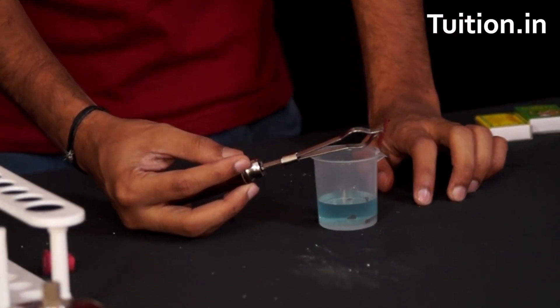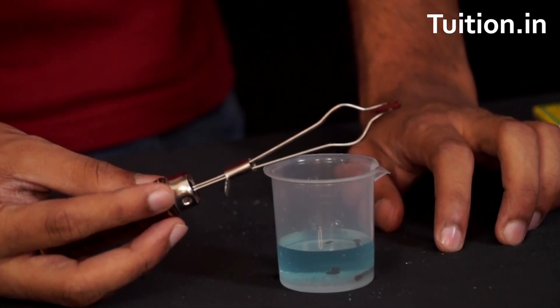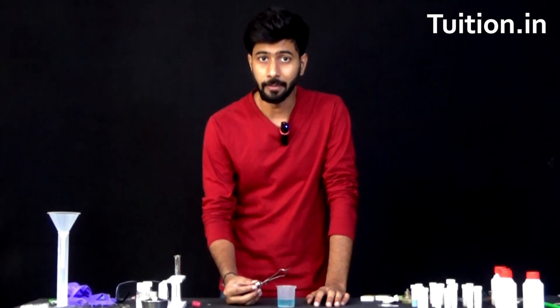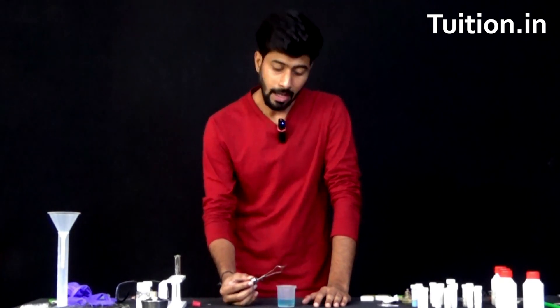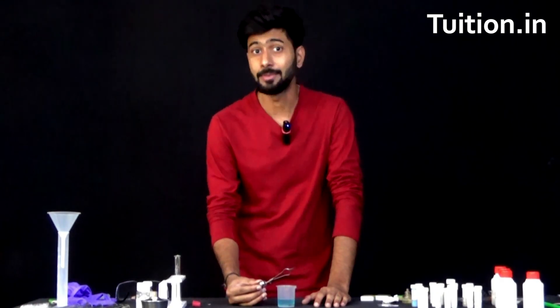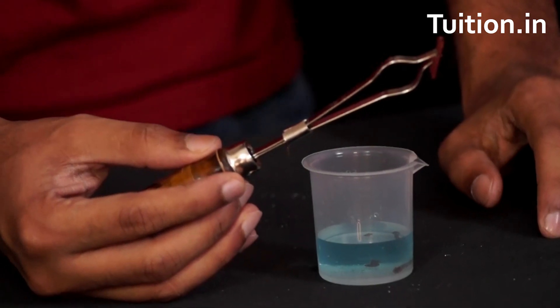As you can see, it is completely changed. It was silver when we put it in and now it looks all brown. That brown thing is all copper. Initially all of the copper was present in the blue copper sulphate solution. After putting iron, most of the copper from the copper sulphate solution has been separated and copper, being brown, is deposited on iron.